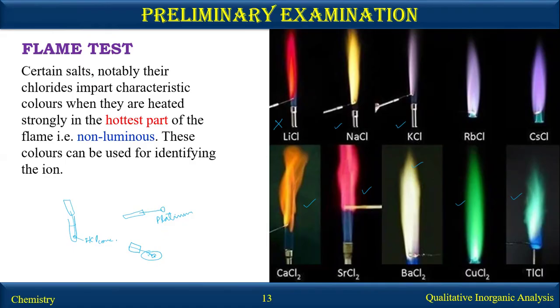So when we touch this with the salt, the salt can contain any anion, but when concentrated HCl interacts with the salt, some of the ions become part of the chloride. For example, suppose the compound was calcium hydrogen carbonate.